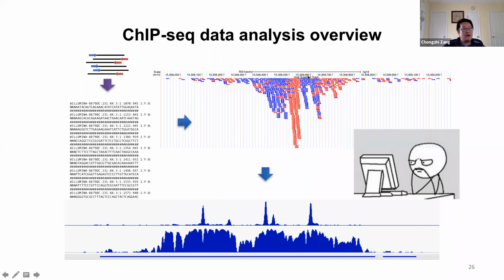Whereas if a number of reads have the exact same start and end location, after piling up they will be just a very narrow spike that doesn't have a mountain or triangle shape. That is another way of distinguishing them.